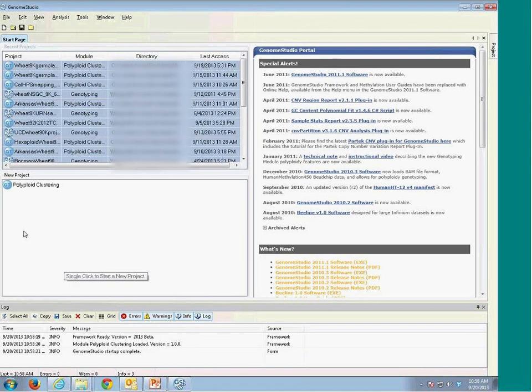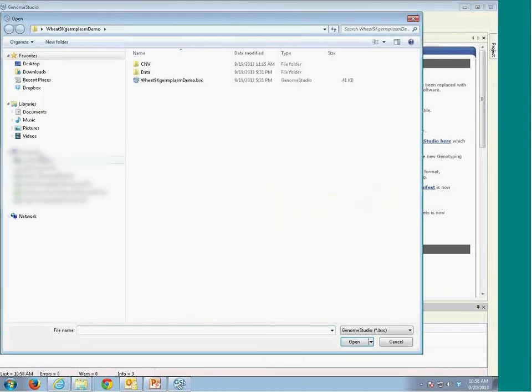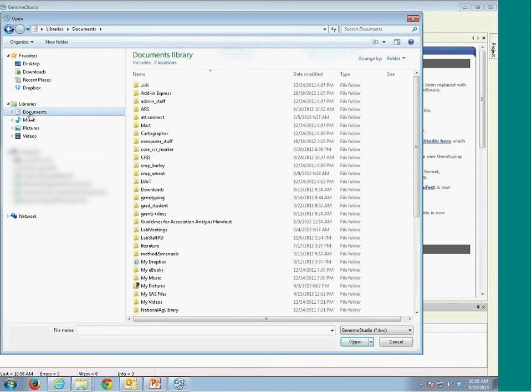So here is the software. I just open it up, and then I'm going to open up a project.